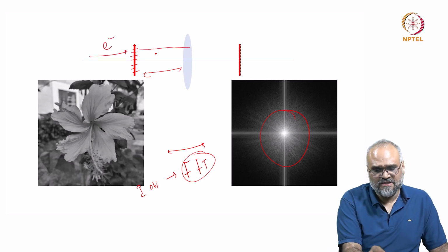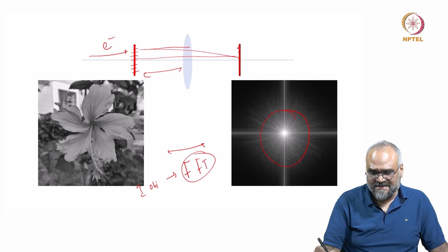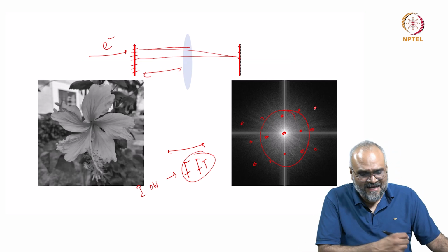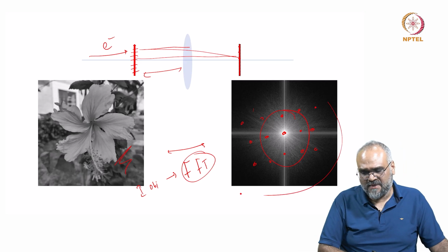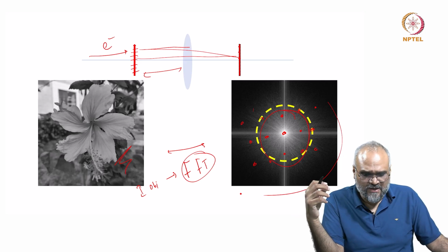They all go through the lens and converge at the back focal plane, and as a result I start seeing the projection of all the planes that are parallel to the electron beam. As you can see, the radial distribution of intensity for a sample like this is random, but when I have a crystalline sample, this changes. So how does it change?